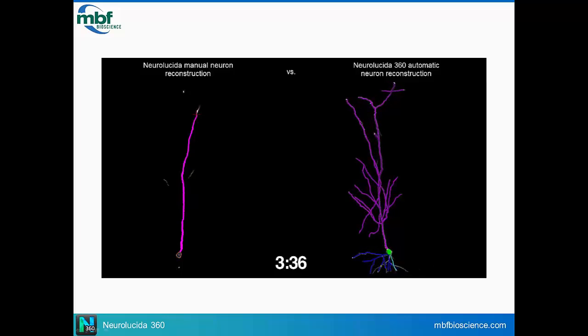Do you think that some of the mounting media choices have an impact on autofluorescence, or not so much? Because I know like Mowiol continues to sort of clear the tissue the longer it sits in it, and I wonder if that would help abrogate some of the autofluorescence. I've never used that. I don't know. I know with our mounting media, we don't really have such a huge issue.